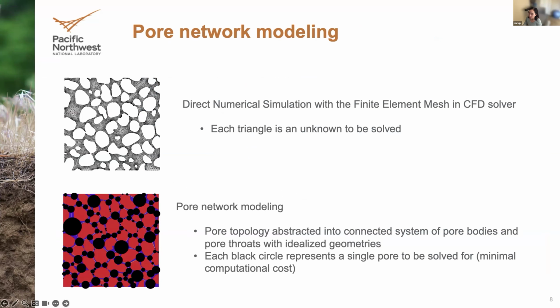Pore network modeling is really thinking about this soil pore topology, how we can take that information and abstract it into an idealized system where we just use different pore bodies, those circles, and then pore throats, the rods, and connect them, right? So they're very abstract. The idea is that they are very simple and abstract, but they should contain the same information in terms of the pore network characteristics.